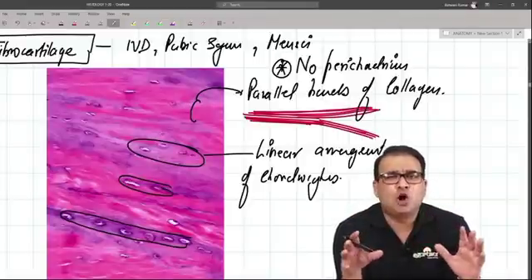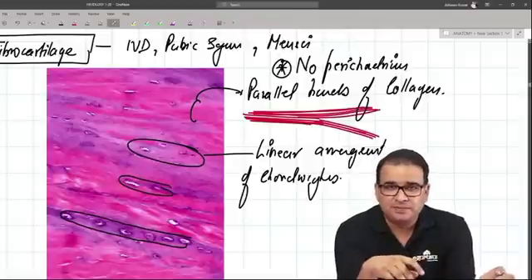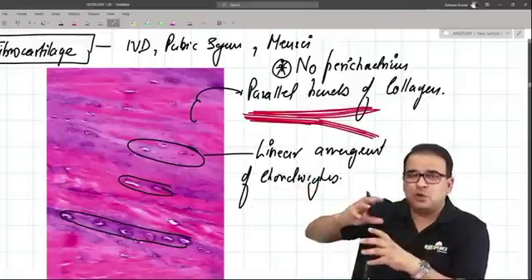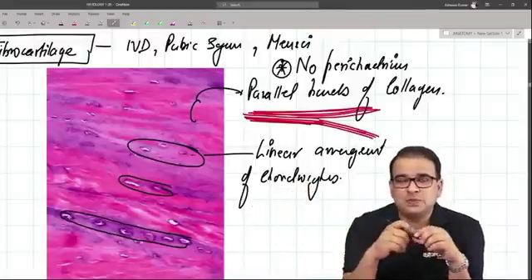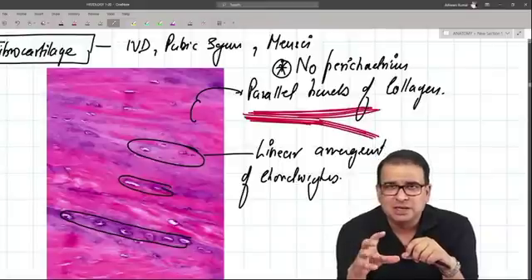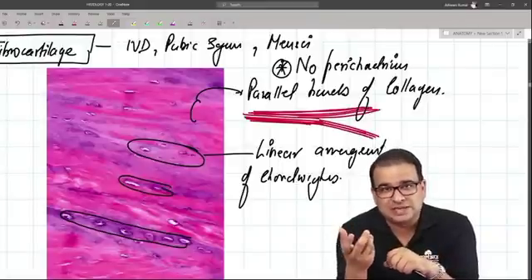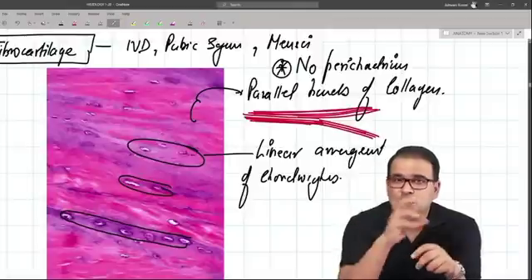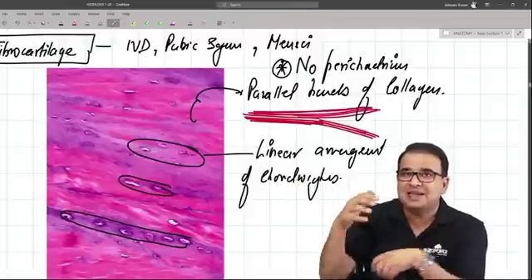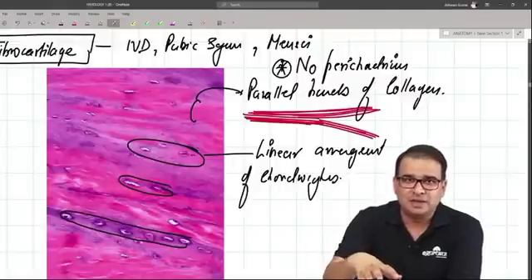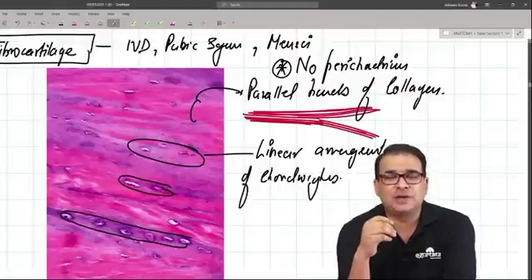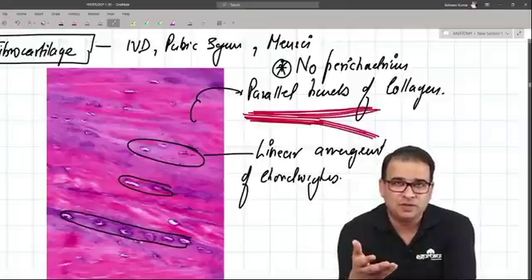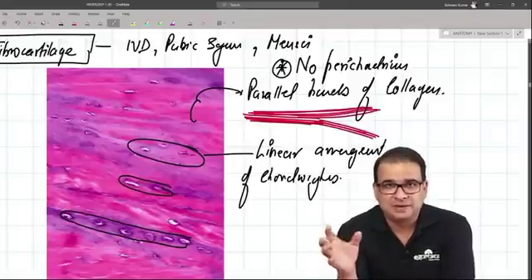The slide of fibrocartilage is very commonly confused with a slide of tendon, because tendons also have parallel bundles of collagen fibers with bundle branching. The key difference is that fibrocartilage has chondrocytes. At low resolution like 10x you may not be able to see them, but if the question is specifically about fibrocartilage, the slide will likely be shown at 40x or above so you can appreciate the chondrocytes.